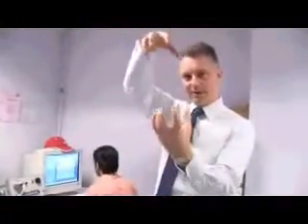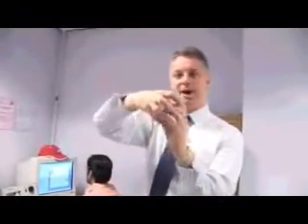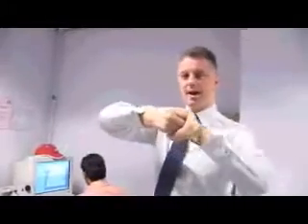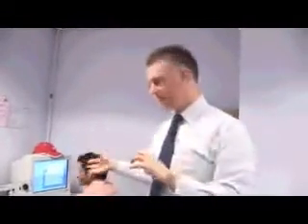This is a slightly different experiment. When I was saying we can measure the forces between molecules, that's what Mudasir is doing here. So what we do now is we bring two molecules together. So this is nanotechnology at its best. We're taking two molecules, we're bringing them together, we allow them to bind, just as would happen in our bodies, the sort of biological process, and then we pull them apart. And as we pull those two things apart, in this case it's a vitamin and a protein, we can understand more about the structures of the things as they bind.